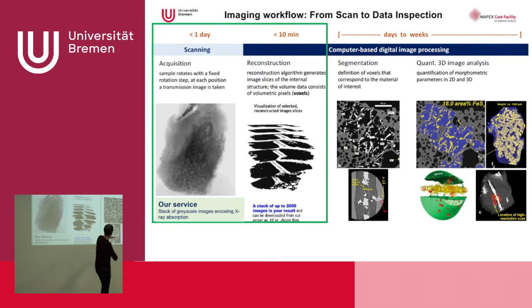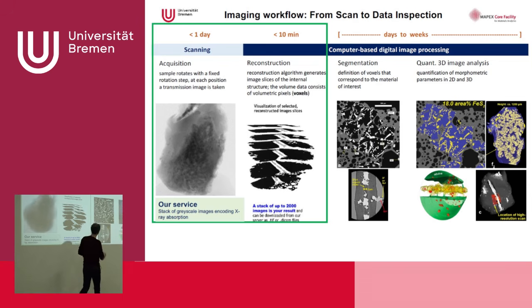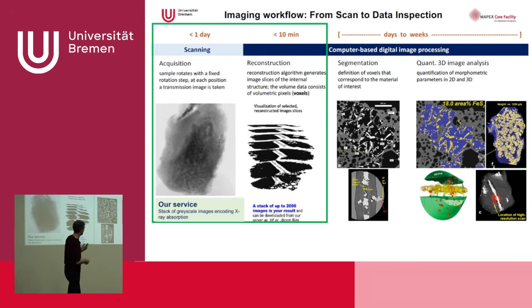When we look into it with a digital image analysis, we can look at the different layers here. We see different materials like air, like iron sulfide, very absorptive, or we have here volcanic glass or something like that. It would be interesting to know maybe some volume percentage of this kind of filling in this kind of void.